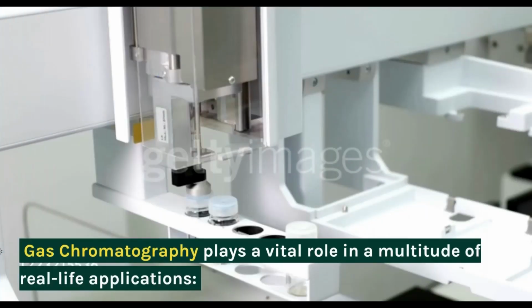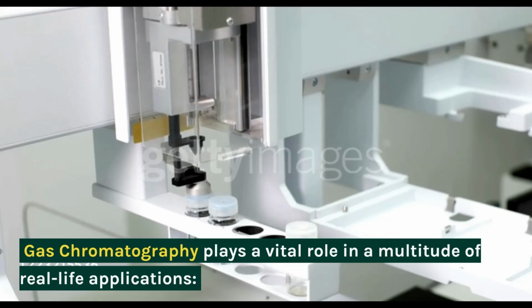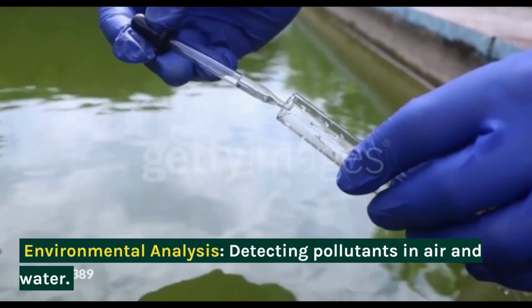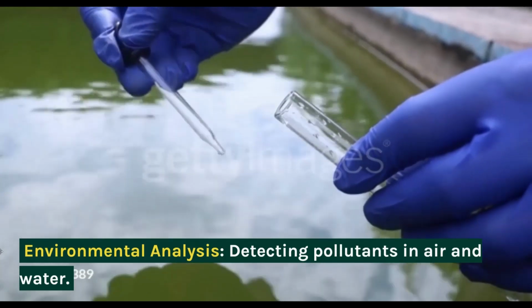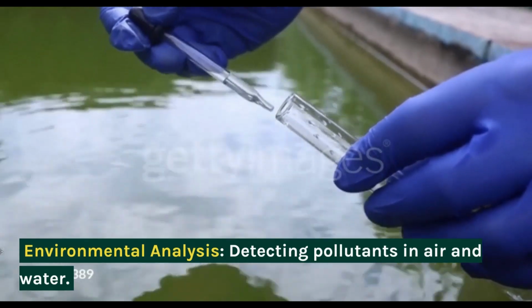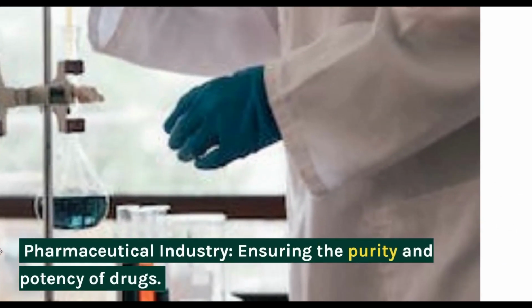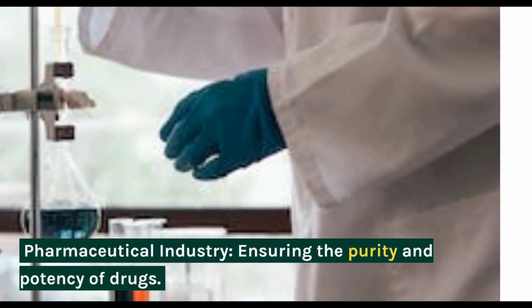Gas chromatography plays a vital role in a multitude of real-life applications. Environmental analysis, detecting pollutants in air and water. Pharmaceutical industry, ensuring the purity and potency of drugs.